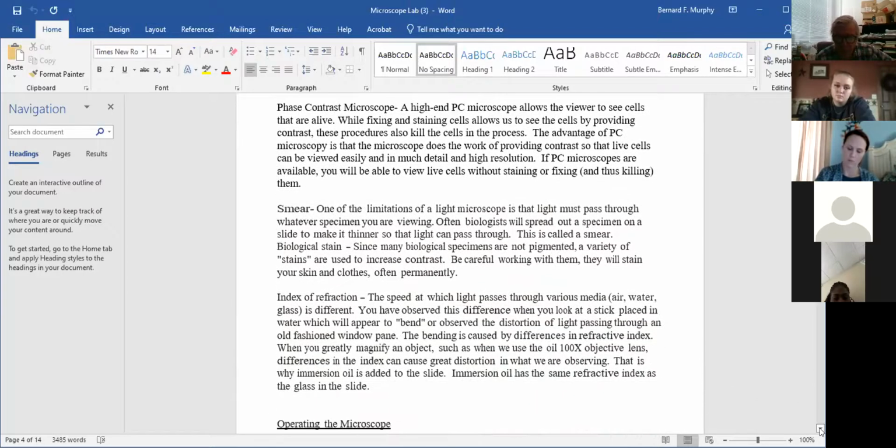A smear, we don't really have to, but a smear is just making your own slide. In lab, we would have looked at two types of slides. One, pre-made slides that were made by some company, and we bought them, and we look at them, and then we put them back. But then there's ones we make ourselves. And these are called smears, and also called wet mounts.